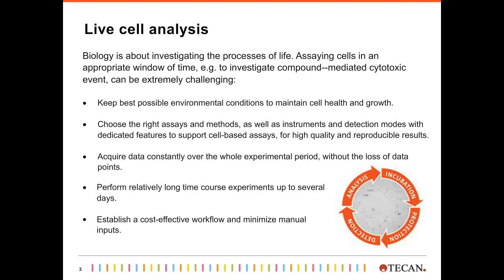So biology is certainly always about investigating processes of life. Everybody of you will know, and I'm sure has already experienced, that assaying cells in an appropriate window of time, for example, to investigate compound-mediated cytotoxic effects, can be extremely challenging, because you first of all need to keep your cells healthy during the whole investigational period.